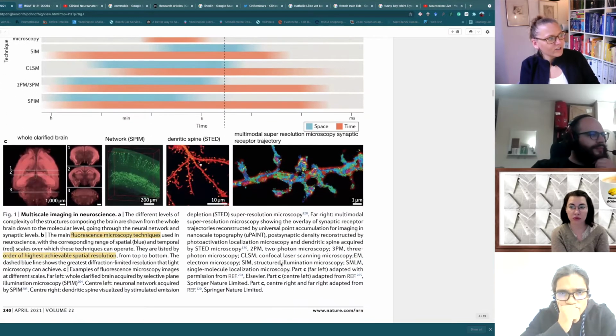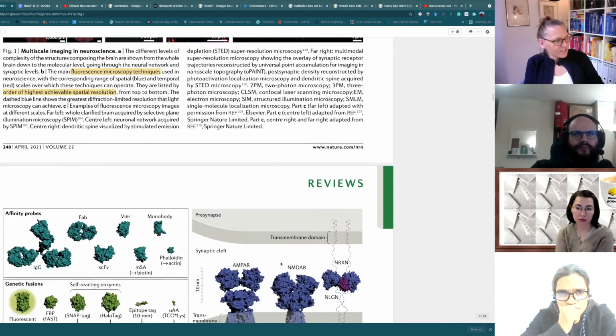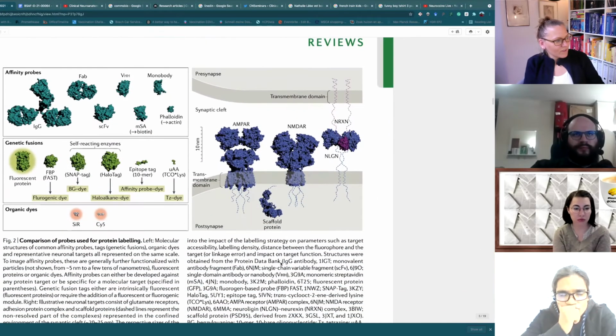And what you can see here already is the combination of the best of both developments: we now have an absolutely stunning resolution, so we can really look at the granularity of the brain at this point, but also the labeling has vastly improved, so you can see the structures at a finer detail. So a very interesting read that I recommend.